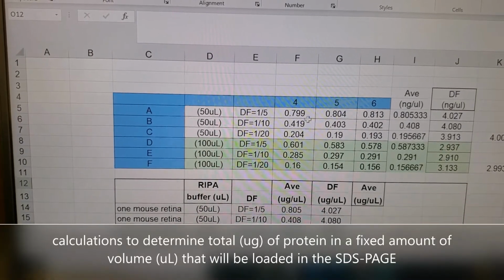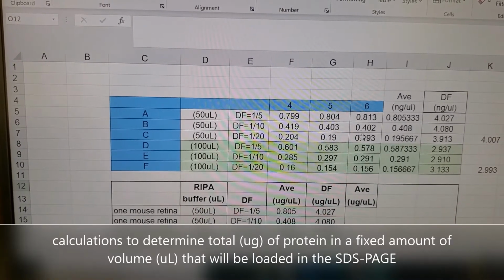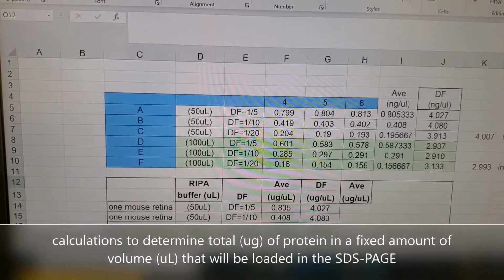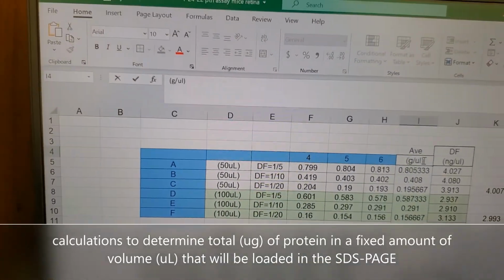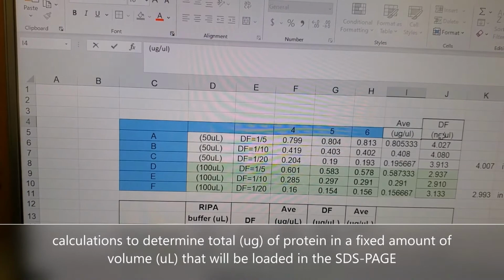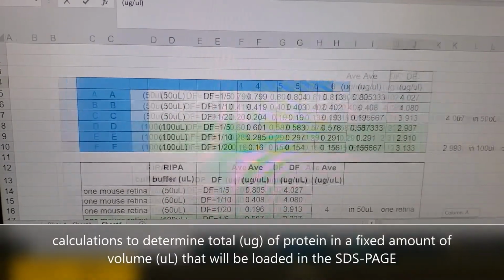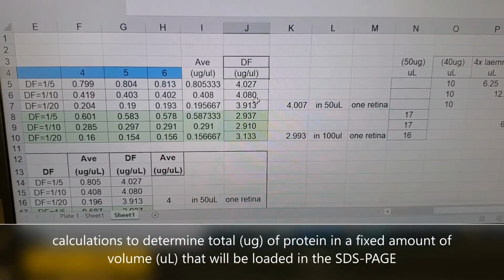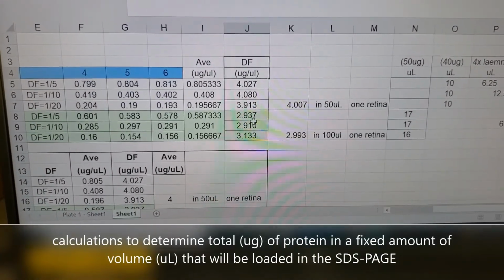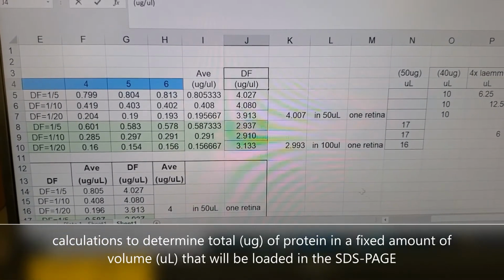So I did my dilution factors, I did my protein assay, I got my concentrations, my average, and this is actually microgram per microliter, not nanogram. So let me change that really quickly. And then I have my average. Since this is the same sample, I just did 3 different dilution factors. So I have my average.